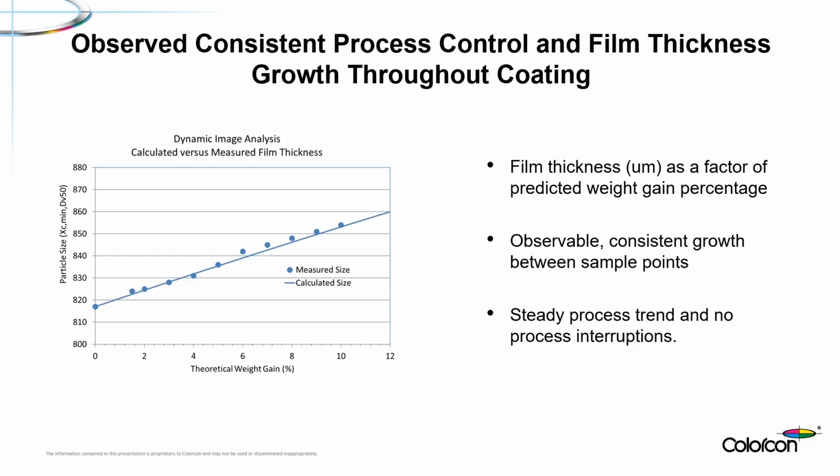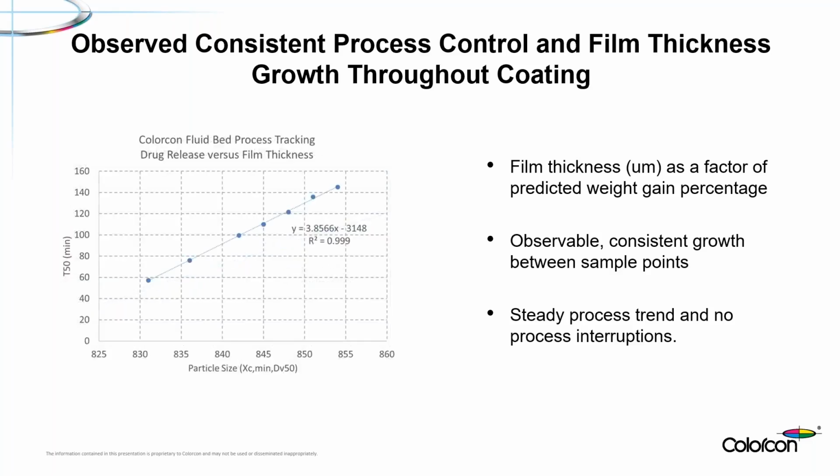If we then plot particle size versus dissolution data, we can see a strong correlation between particle size or film thickness and dissolution performance. Combining predicted values from our computational design tool and in-process tracking enables a greater understanding of the relationship between film thickness and dissolution performance.